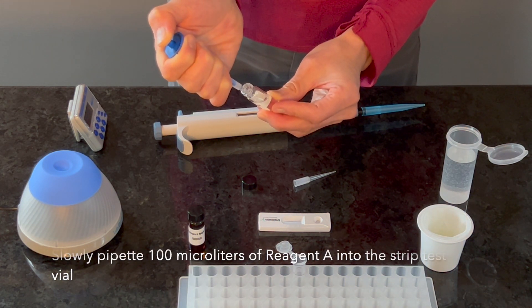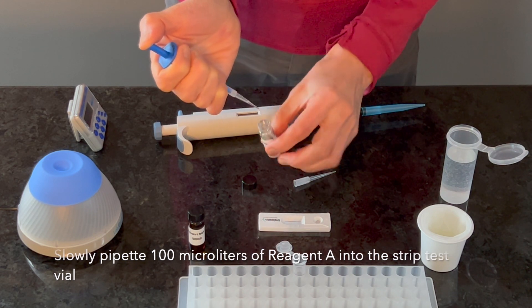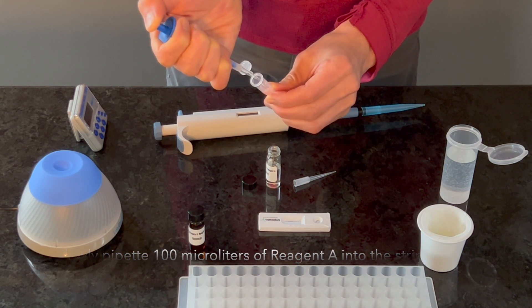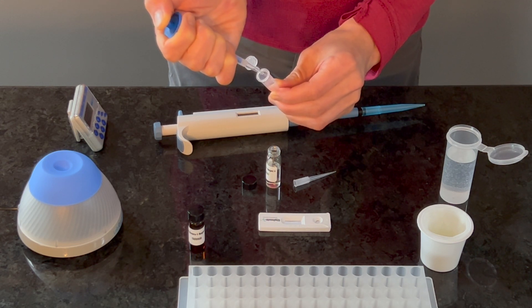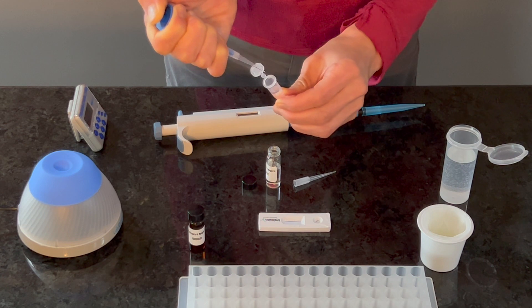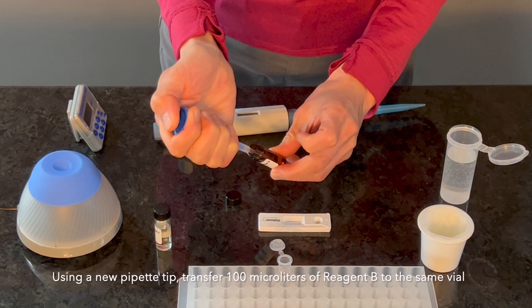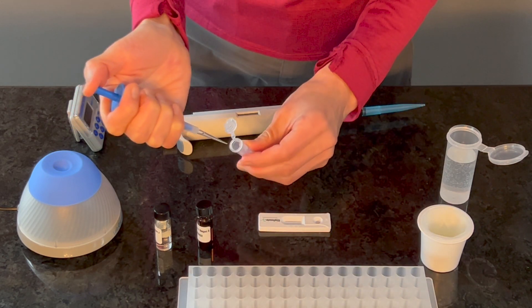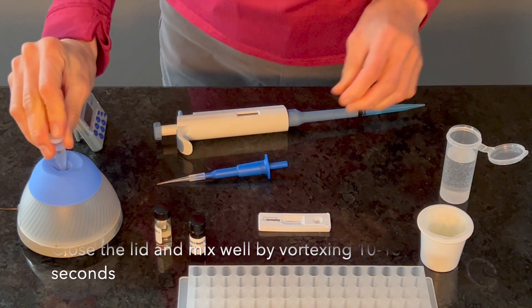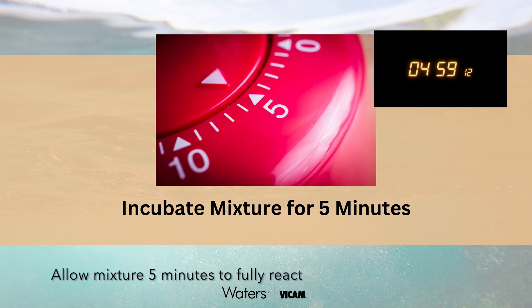Reagent A is viscous. Pre-wetting the pipette tip is recommended, with a slow and consistent delivery to ensure complete delivery of the reagent. Pipette 100 microliters of Reagent B into the same vial containing the water sample and Reagent A. Close the lid and mix well by vortexing for 10 to 15 seconds. Allow 5 minutes for this mixture to react.